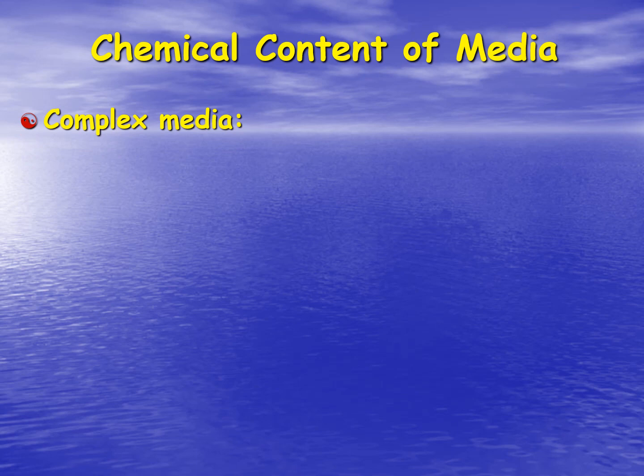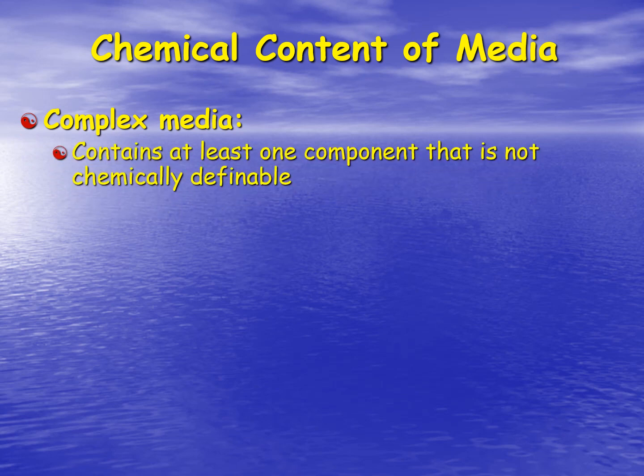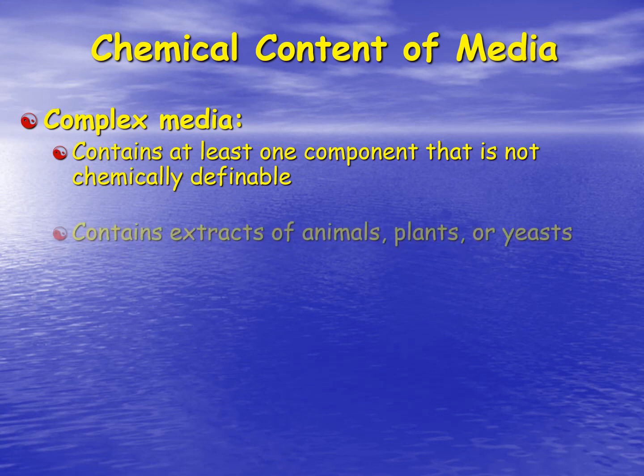More often than not, we're going to use complex medias, and these contain at least one component that is really not chemically definable. Our brain heart infusion, or BHI, broths or agars, these are complex medias because some of the proteins within that media are broken down by enzymes, and exactly how much is broken down to be available to the microbe, we're not completely sure.